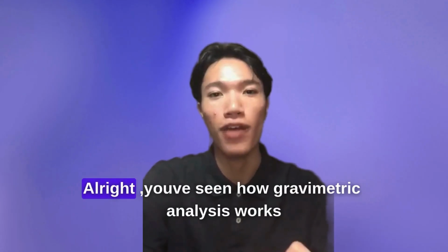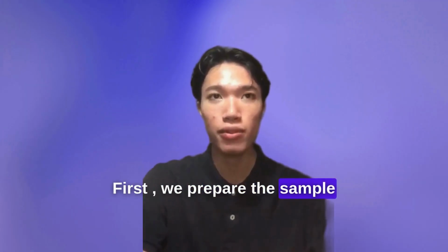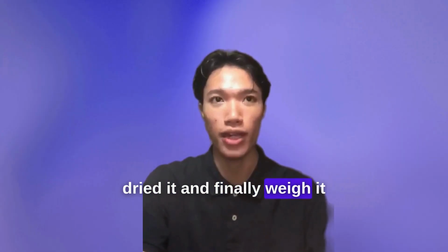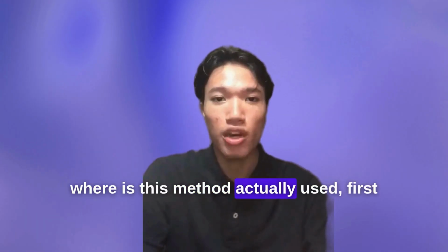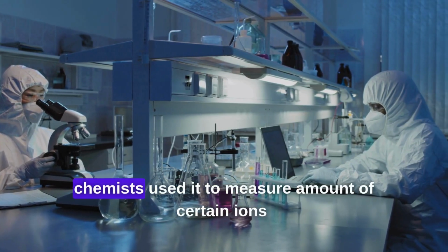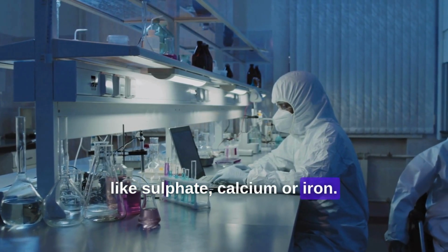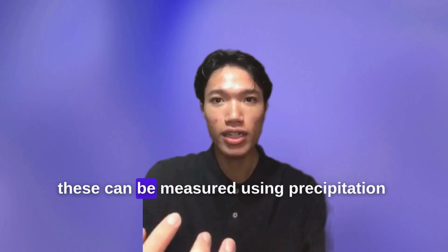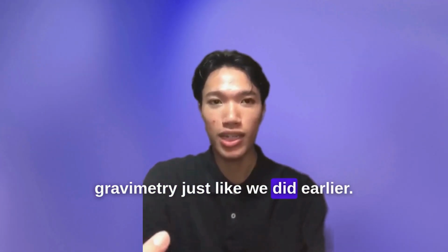Hi guys, alright, so you've seen how gravimetric analysis works. First, we prepared the sample, we precipitated the analyte, we filtered, dried and finally weighed it. But now, you might be wondering where this method is actually used. First, of course, in chemistry labs like we mentioned before, chemists use it to measure the amount of certain ions like sulfate, calcium or iron. For example, the calcium in milk or the iron in ore can be measured using precipitation gravimetry, just like we did earlier.